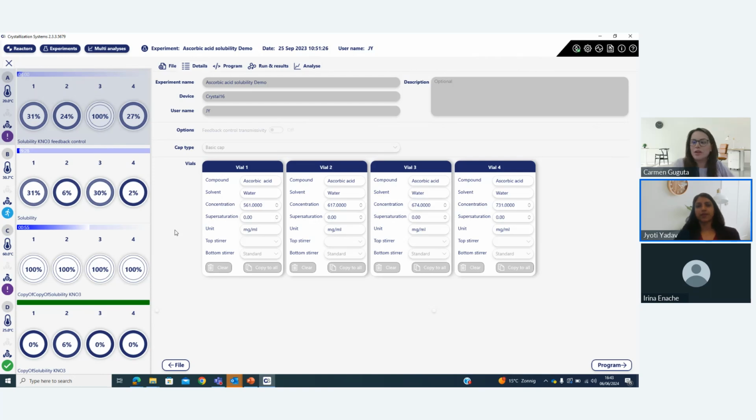Yes, so rare earth is the material that is actually in the magnetic stirrer, and you can identify it. Usually they are white with a black dot on it, and create a stronger magnetic field, so it mixes much better. Also, I wanted to add something.